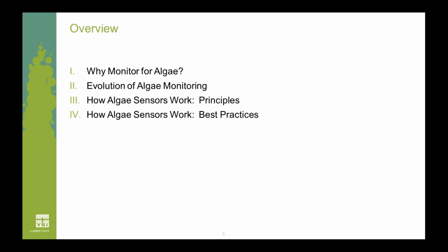All right, let's just quickly walk through the agenda for today. We'll be discussing why monitor for algae, the evolution of algae monitoring, how algae sensors work, the principles, and then how algae sensors work, best practices.